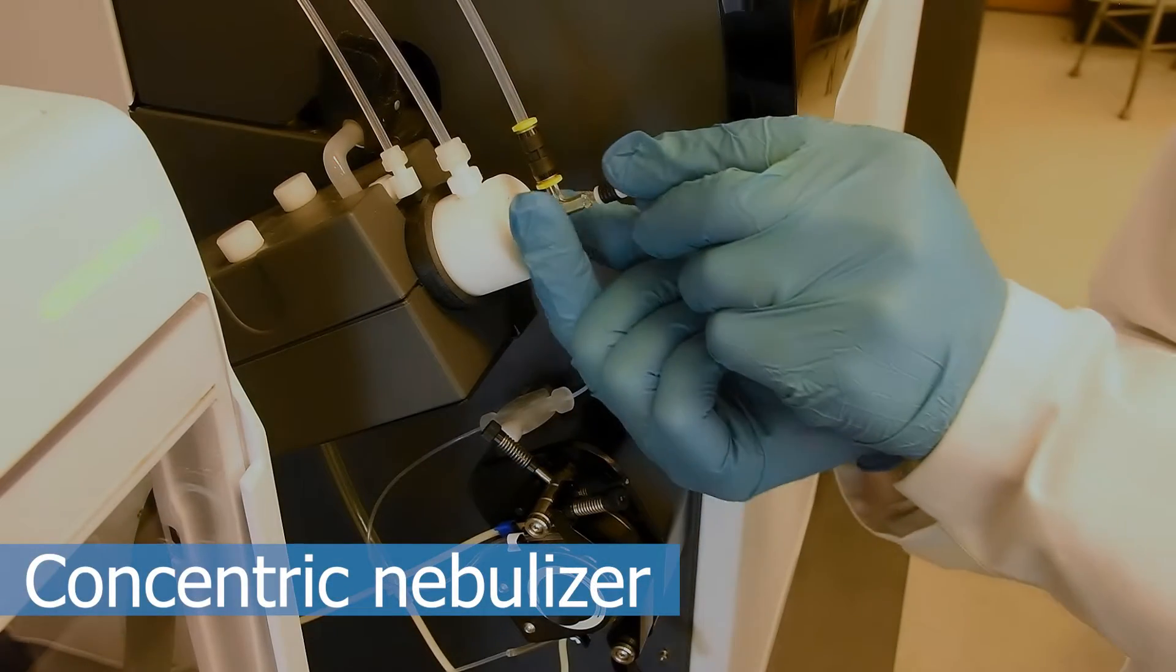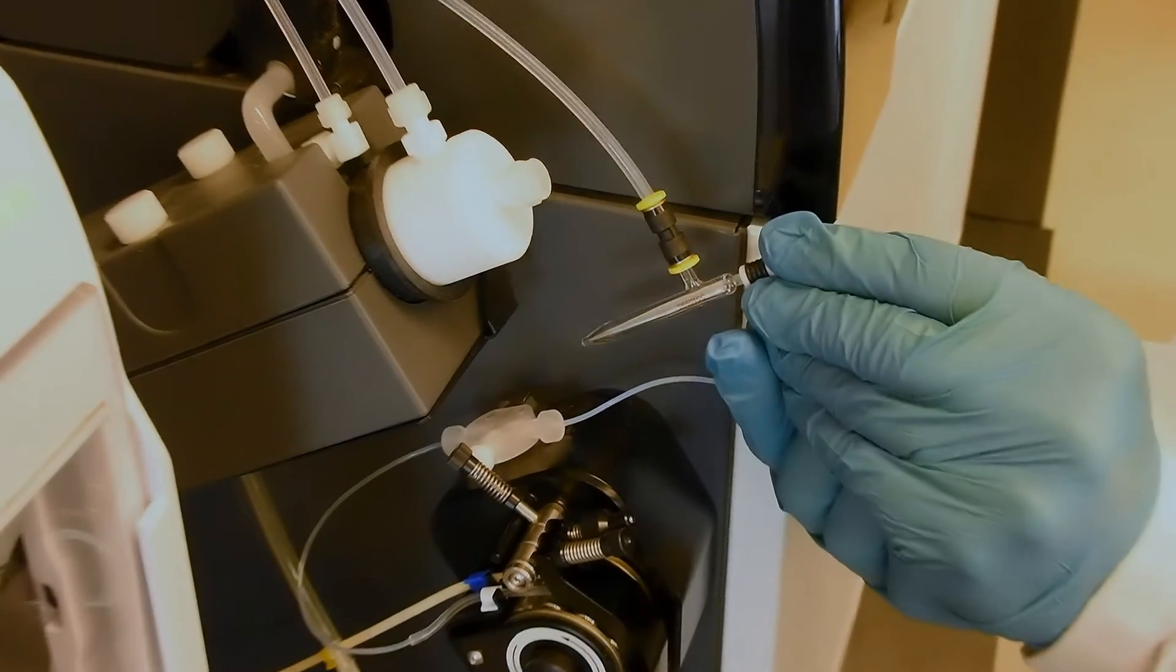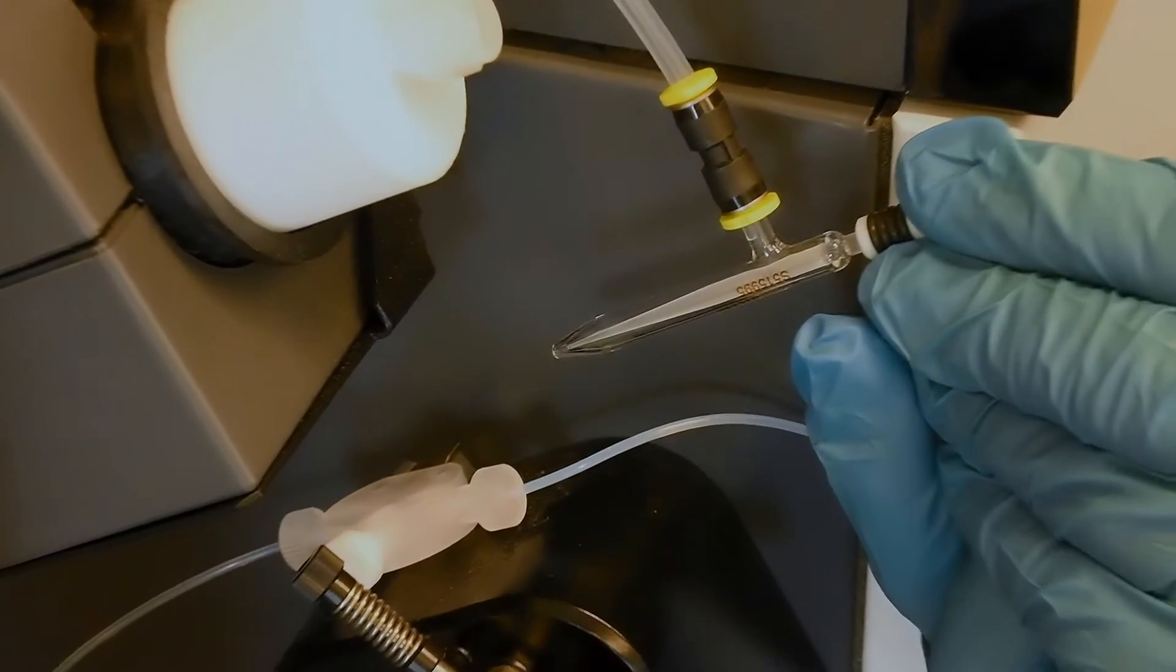This is a concentric nebulizer. Argon gas flowing rapidly out of the tip draws solution out along with it, creating a spray of aerosol.